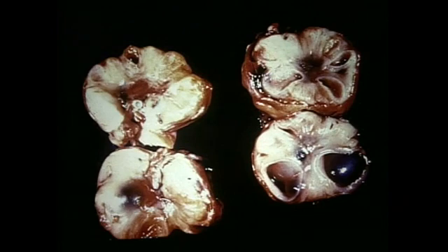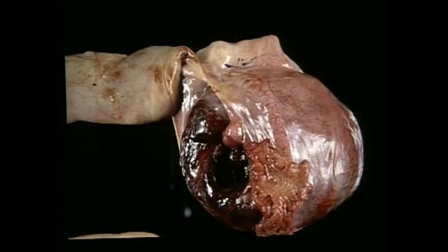Here is an opened ovary to make the point that the Graafian tertiary follicles are quite large. Here is the stroma of the ovary to show the density of fibroblasts arranged in bundles and whorls. Again, it should not be misdiagnosed as a fibroma or fibrosarcoma. And then also the corpus hemorrhagicum is a prominent structure which should not be confused with a hematoma or even a hemangioma or hemangiosarcoma. So this creates a rather unique situation, a normal, physiologic, unique situation that one can encounter as far as the mare's ovary is concerned.